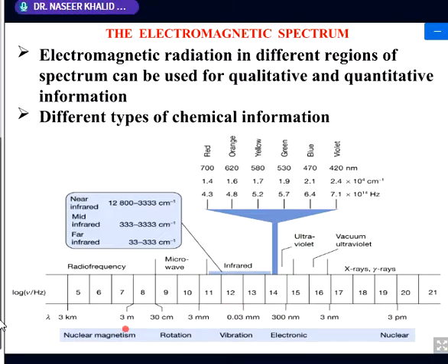This is again the X-rays, gamma rays, then the UV region, and then there is a very small portion that is the VIBGYOR, the visible region, ranging from violet, blue, green, yellow, orange, and ultimately red. So 7 colors. Beneficial for human beings.